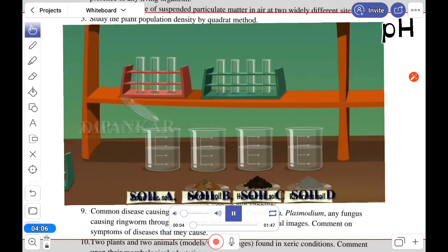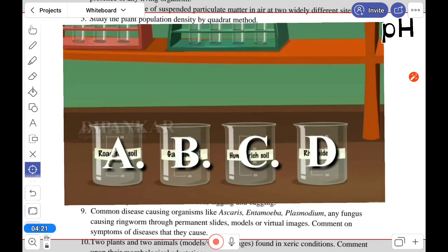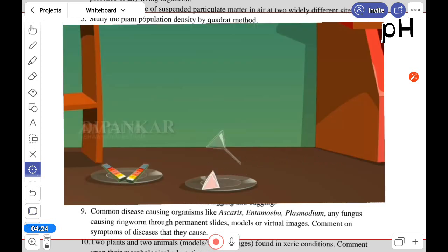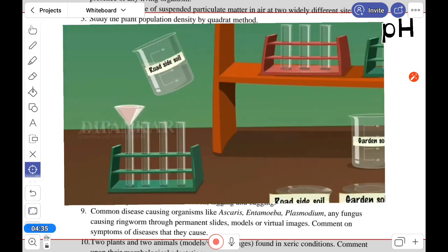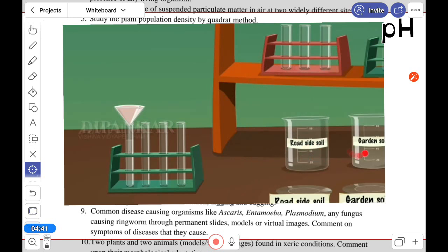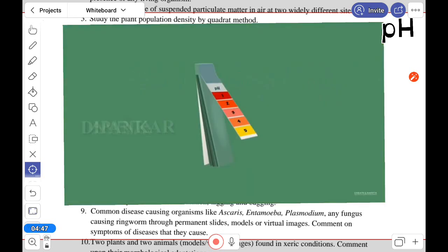First, pH of soil. To test soil pH, we have to make a solution of the soil. Here we take plain water, and after that we mark the solutions as A, B, C, D. Then we will filter it. Here is the filter paper, and here is the soil dissolved in water. All four samples are in test tubes.